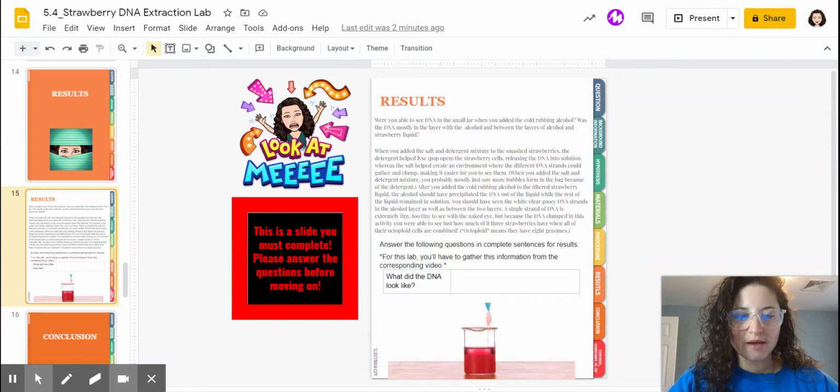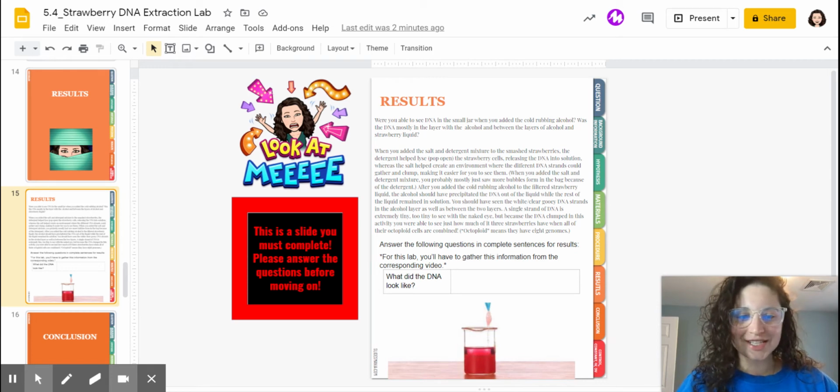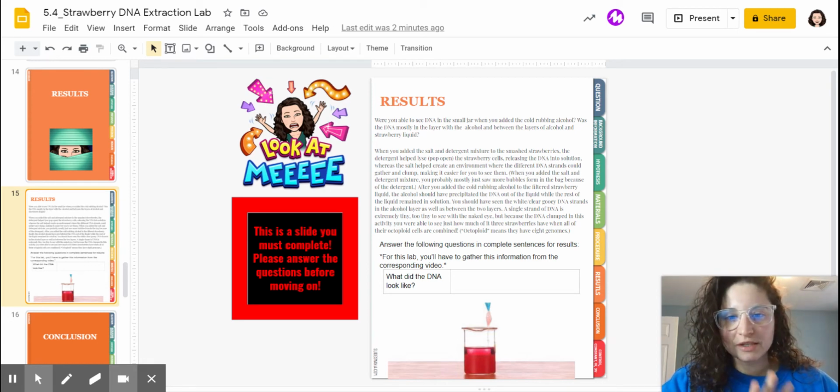So now that you have finished watching this lab in action, now that you've gotten to see what the DNA actually looks like in the previous video, I just want to take a moment and make sure that we are filling in the results section for this lab. So I'm on slide number 15. Basically, you are describing what DNA looked like to you.